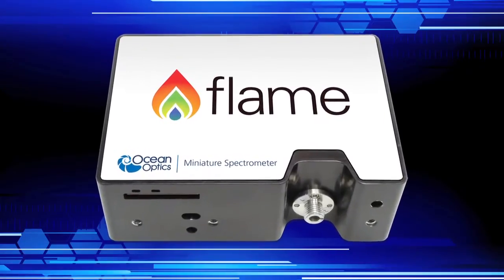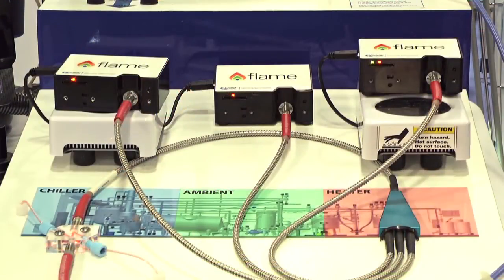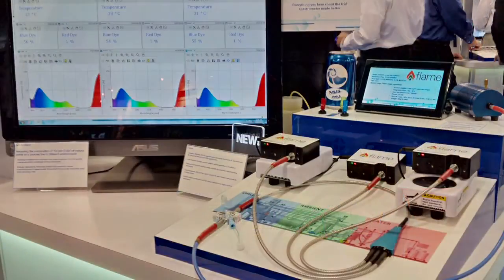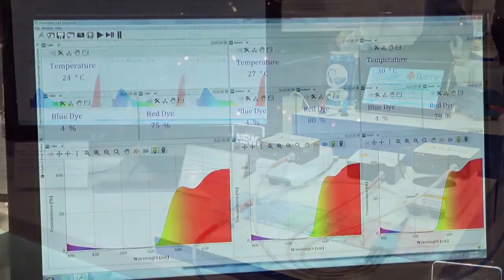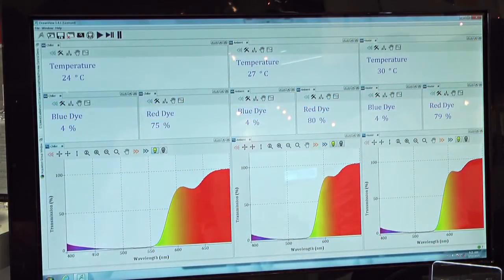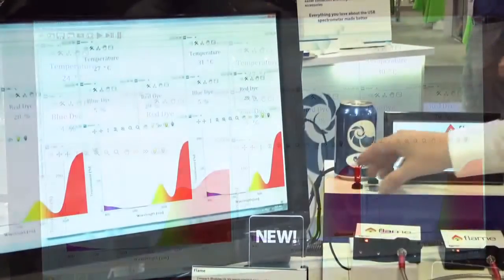The flame spectrometer here allows us to do this. We've got the chiller, the ambient, and the heater that we can see there. We've got the dye in our process line. Imagine yourself walking around that factory — we're getting the same result over and over again, as we can see on our process monitoring screen.